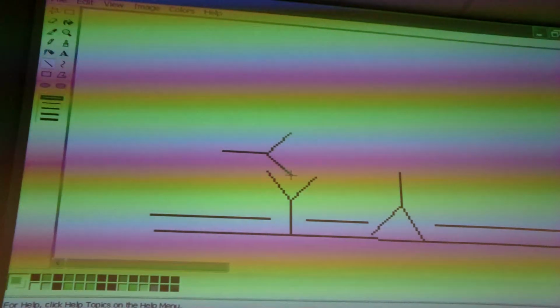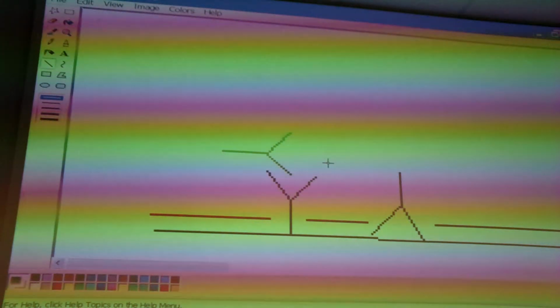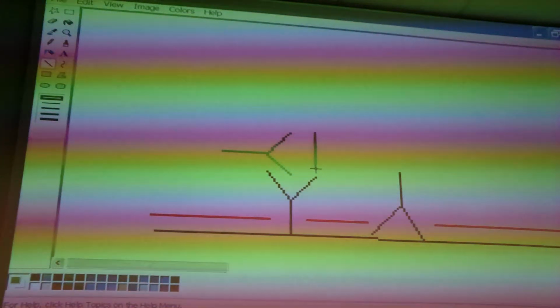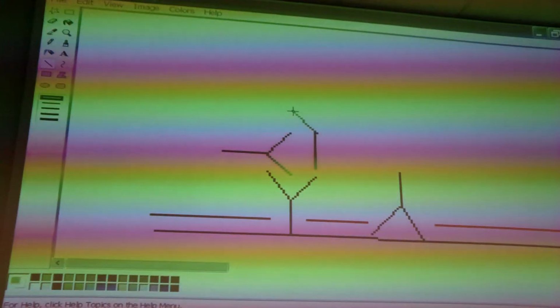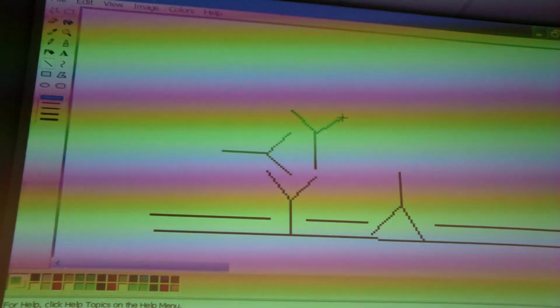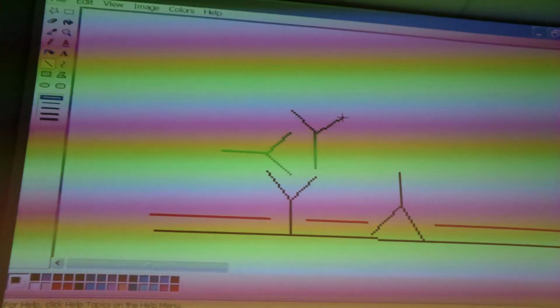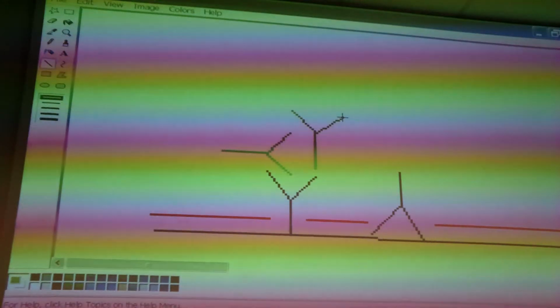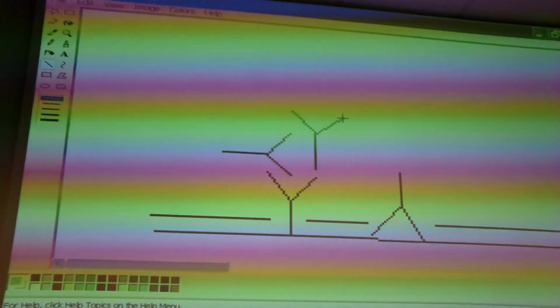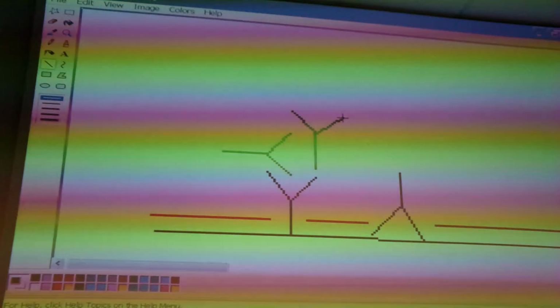I bet the human antibody would not bind this way. Why not? I don't know. Maybe we would make the black antibody so that it binds to the FC region. Because if we want to detect IgG, then we would make it specific. You think it only binds like this? Or it should? I guess because the arms are sticking up, we want to make them specific for the FC region, which is specific for IgG. IgGs have a certain FC region. Yeah, this is true. And we want to try to only catch these.